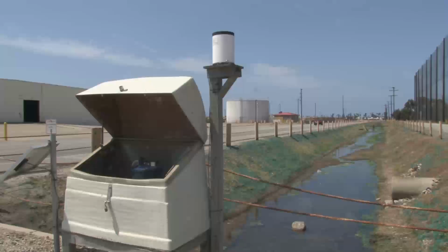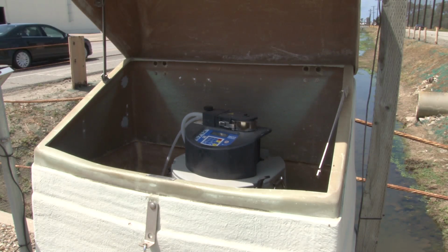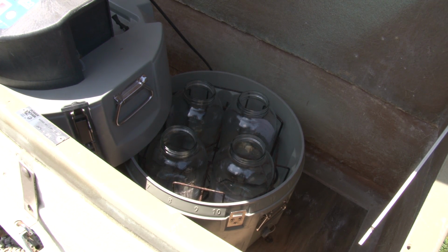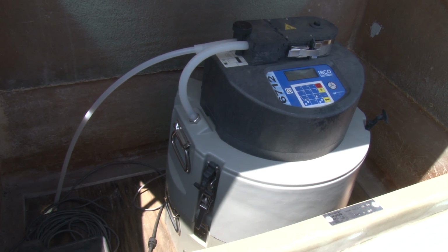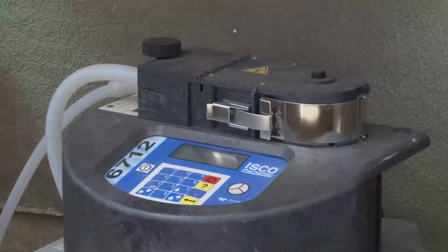Some installations may have access to automated sample collection equipment. This may be beneficial if allowed to be used to collect timed and/or measured samples under certain conditions. If your installation has existing auto-samplers, information on maintenance and operation should be included in your installation SAP. If you would like to install auto-samplers, first discuss with your regulators to ensure they are acceptable under the permit.